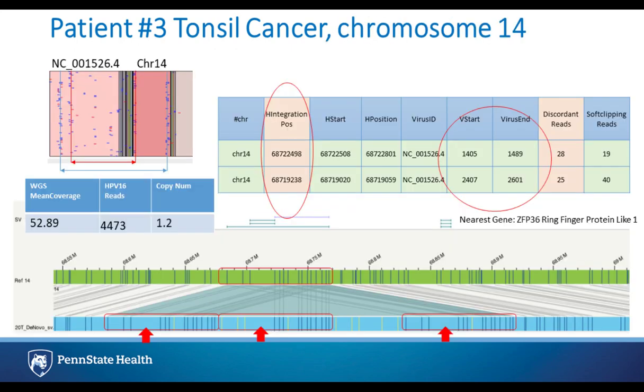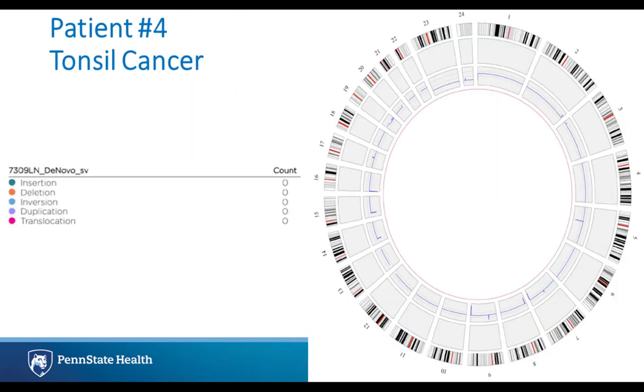This is HPV-16 coverage. And we can use these integration positions based on the sequencing to line it up to the structural variant that we see using genome imaging with Bionano. And we can see that there's a region here where the virus is presumed to be inserted based on sequencing, that we can see that an insertion happened, similar to the red arrow. And we can see actually that this kind of repeats itself multiple times in the region as well. And so again, by combining both platforms, we're able to get kind of detail that you can't really obtain with our technology alone.